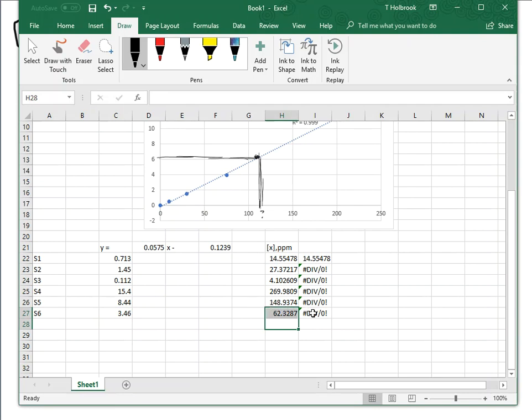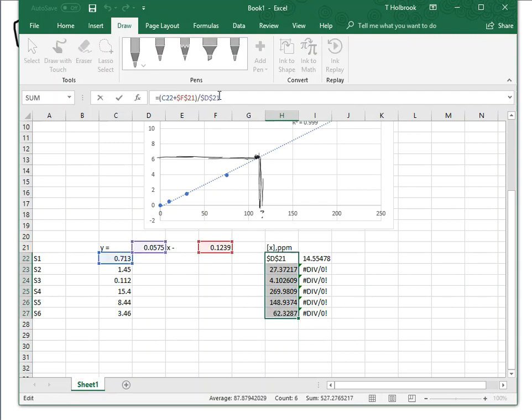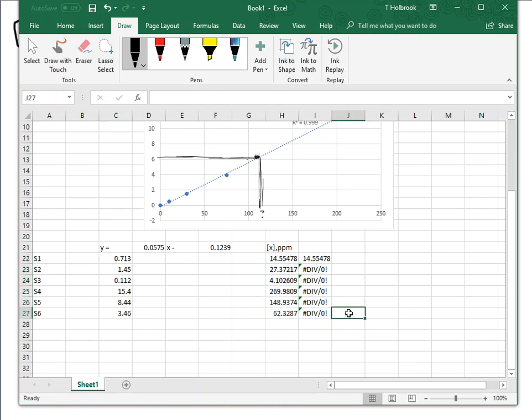And when we've got a lot of things to do in a lab, we don't want to waste our time on these calculations that are showing up in these spreadsheets. So if I can quickly just anchor those values that I don't want changed, that I'm going to be using over and over and over, and then just click and drag, you saw it took a couple of seconds to do 6 samples that were analyzed in a lab. Now imagine if you had 200 samples in a lab. 500 samples in the lab. You're not going to want to do that by hand with every single one of them. You're going to click and drag. You're going to automatically let it populate, and that's what it does.